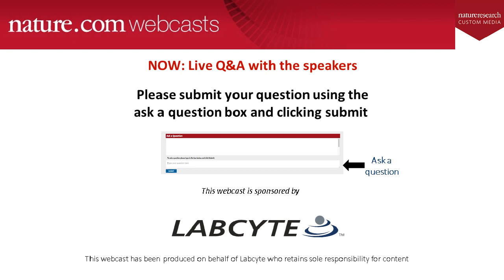Yeah, so after we create our libraries, we get some sort of QC feedback, so that would be fragment size analysis, as well as some sort of quantitation, which can be fluorescence-based or qPCR-based. Our latest favorite has been to run a cheap and small sequencing run. For example, a MiSeq Nano, or on an iSeq, you can do a run just to get the index distributions.